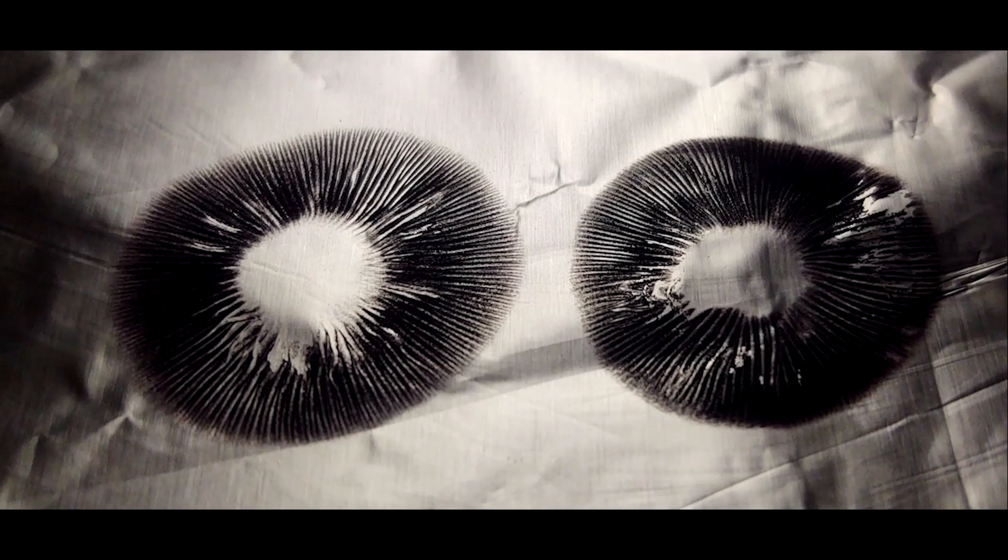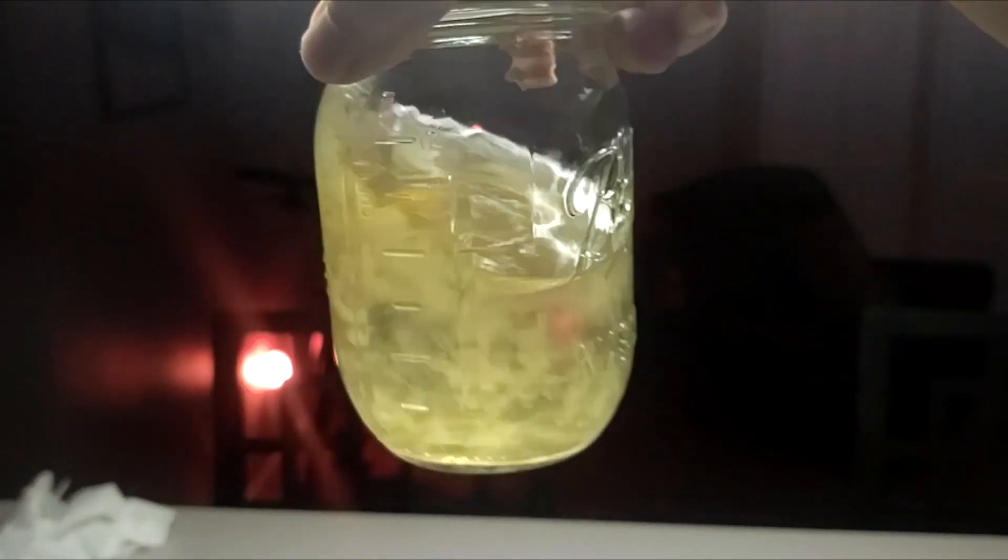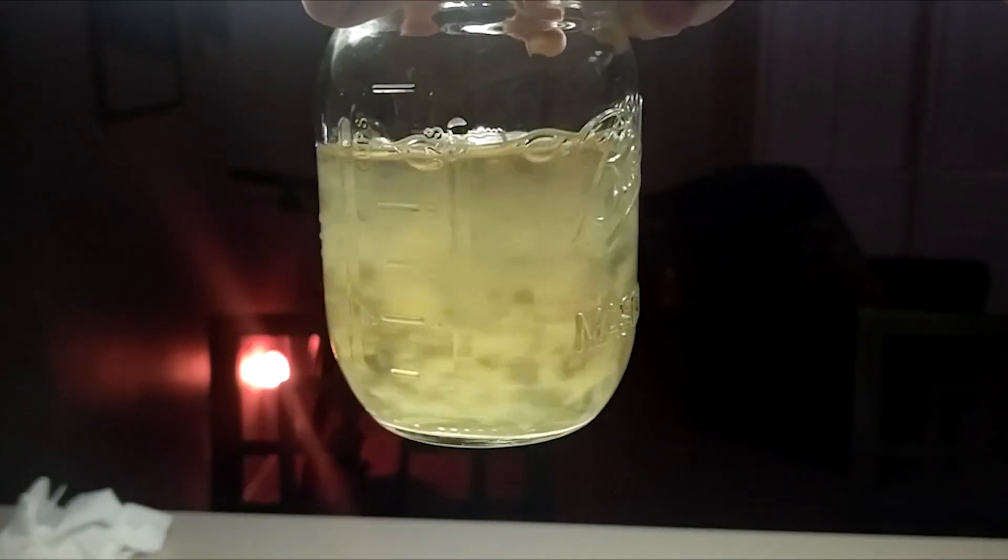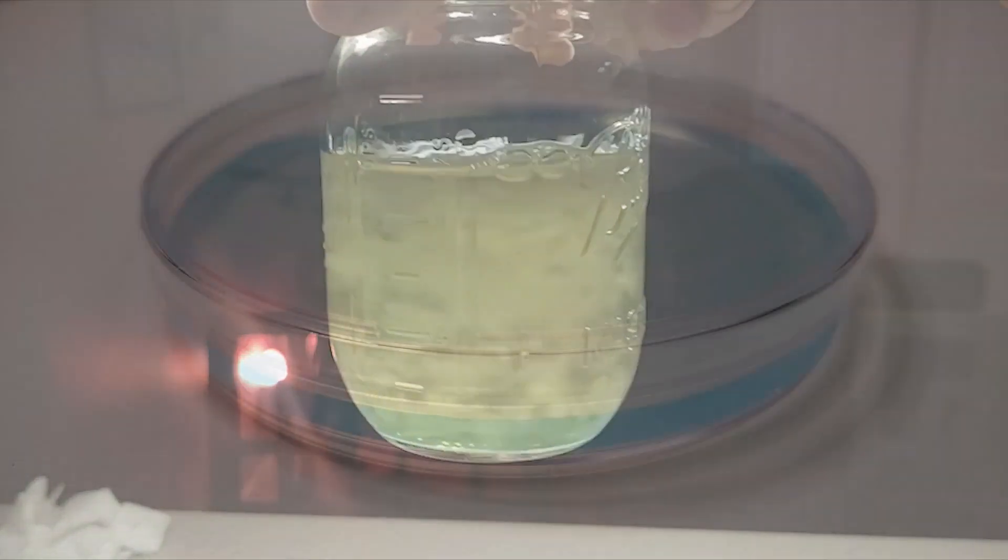When working with spores or cloning best fruits, it is always our goal to create a liquid culture. Liquid culture is mycelium suspended in nutrition—like a liquid petri dish without the agar in a jar.